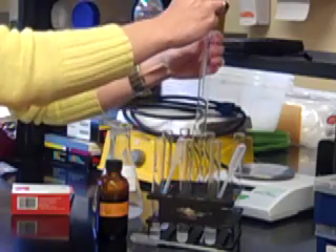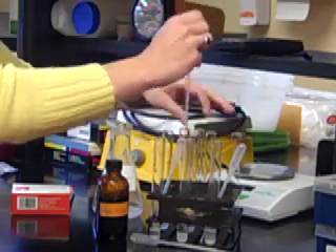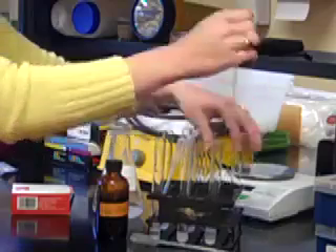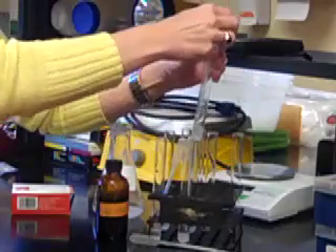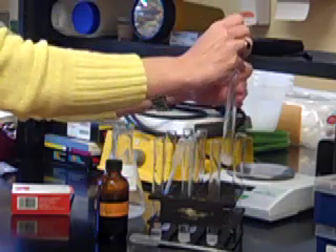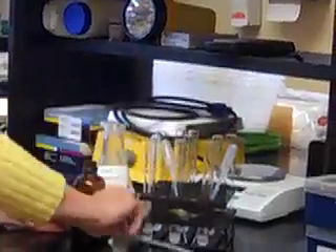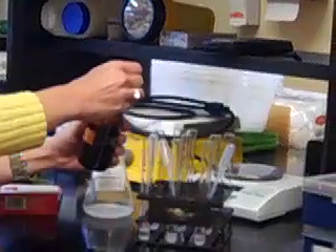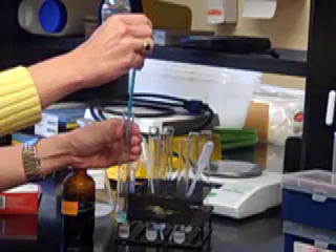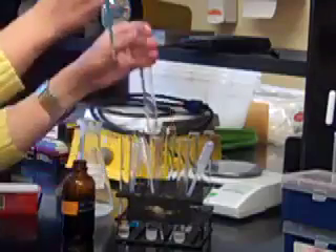So 20 drops. This is my starch and water. And then 20 drops of starch and saliva in my last sample. So now I need to add an equal amount of Benedict's to each one. I'm going to add 20 drops of Benedict's. You can see that the Benedict's reagent is blue naturally.